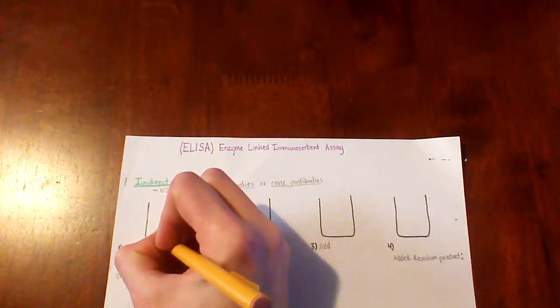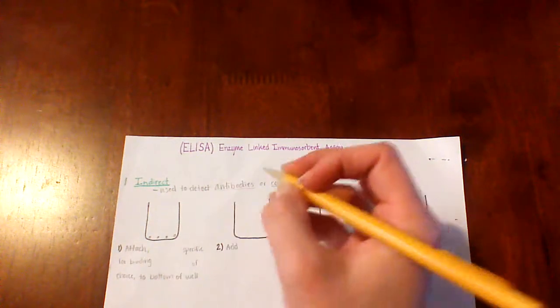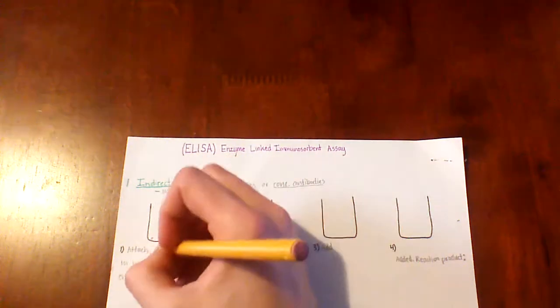So for the first step, I've drawn the well for each step here. And in the first step, the well will be coated with antigens. Antigens that are specific for the antibody of choice.